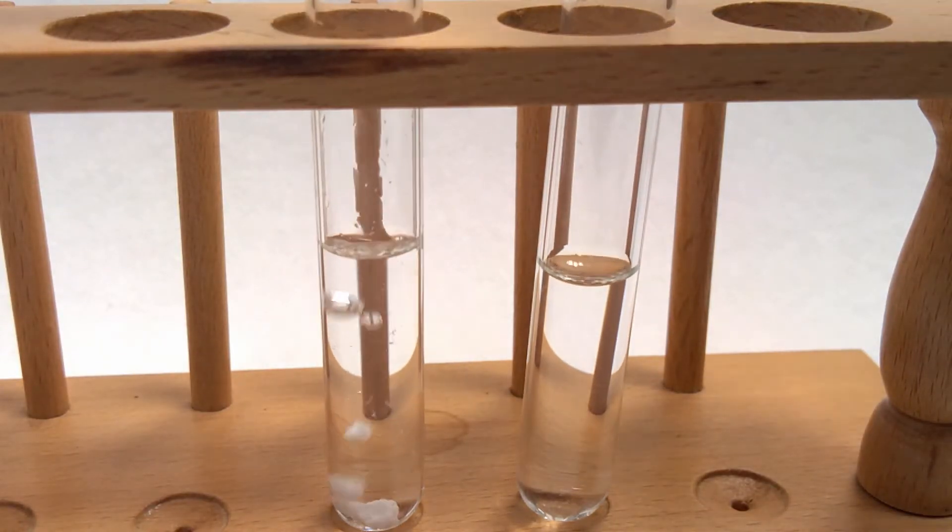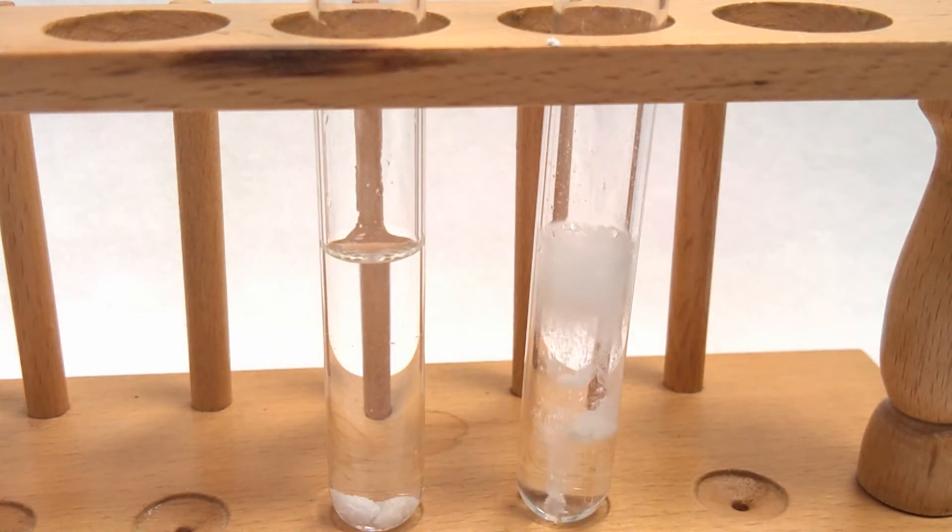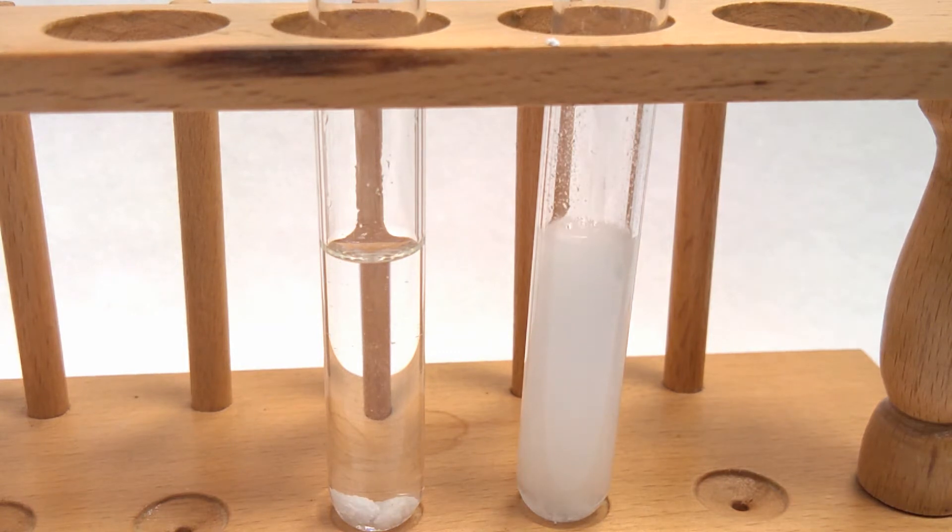Here's another example of the effect of particle size. The two test tubes both contain one molar hydrochloric acid. The one on the left has some marble chips added and the one on the right has some powdered calcium carbonate, chemically exactly the same. As you can see the powdered carbonate reacts much more rapidly.